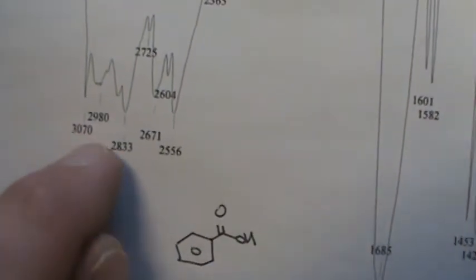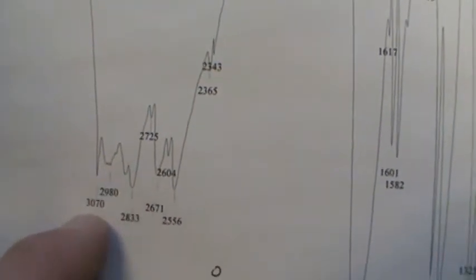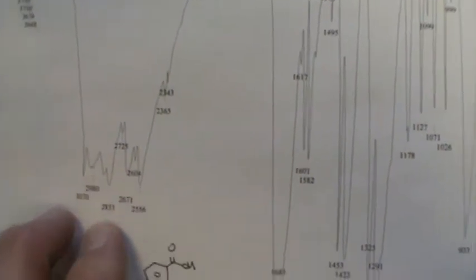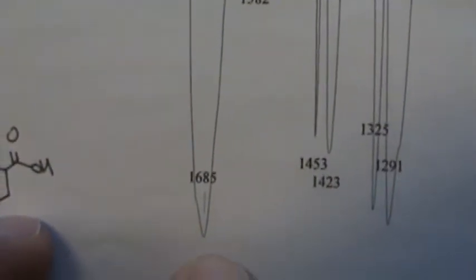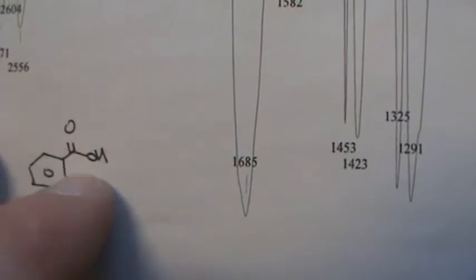So that's why I'm equally skeptical of pointing at 3070 in this particular one and saying, oh, that absorption right there has to be an sp2 carbon with a hydrogen stretch. They're buried in there, I'm sure, for this compound, but you don't have to label those in this particular one. The carbonyl, 1685, that's obviously the C=O stretch.